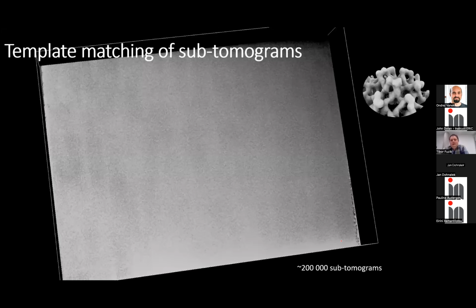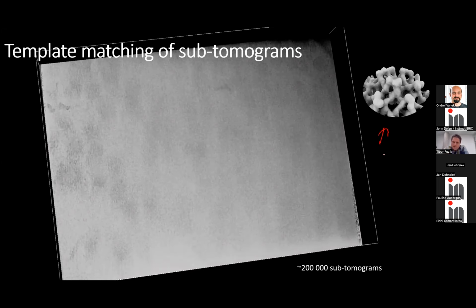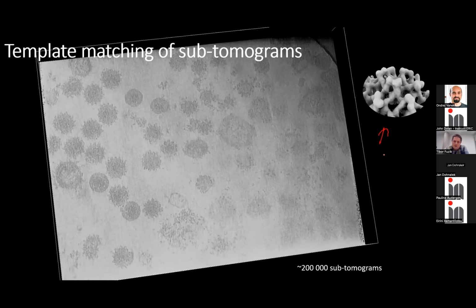What we did next, when we collected our tomograms, we performed template matching. What we used was a single spike from a single particle reconstruction, a little bit surrounded with other spikes to make the correlation easier and give more signal. However, for the subtomogram averaging itself, we used only the central single spike.